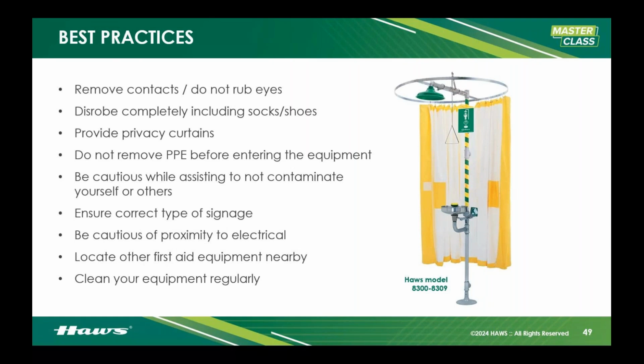Because if you remove goggles immediately after being exposed to something or sprayed with something, the likelihood that it's going to run into your eyes is highly likely. Be cautious not to contaminate others, right? Yell and scream instructions at your coworkers on how to get to emergency equipment.